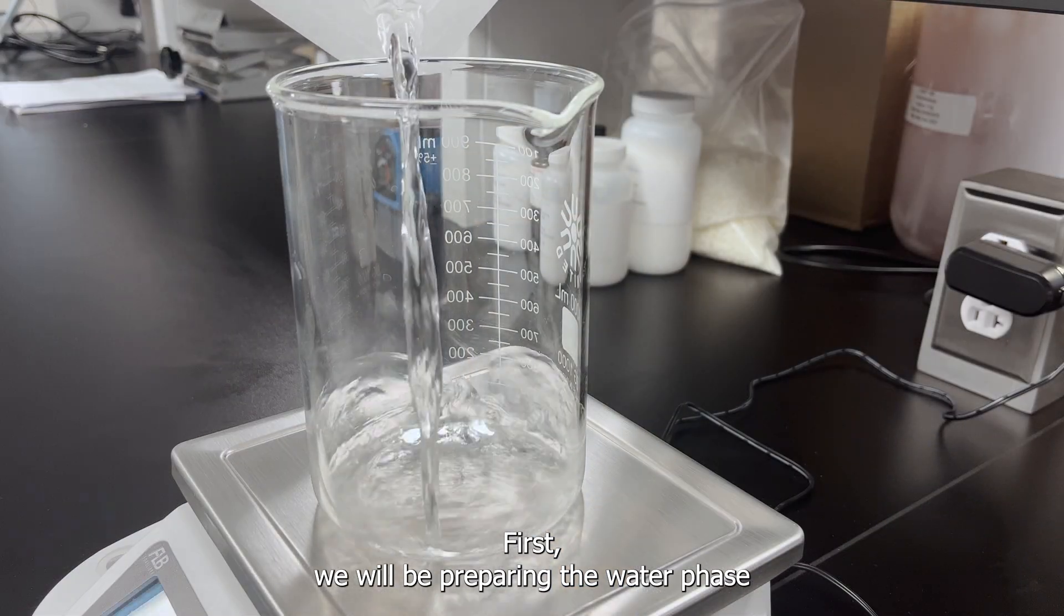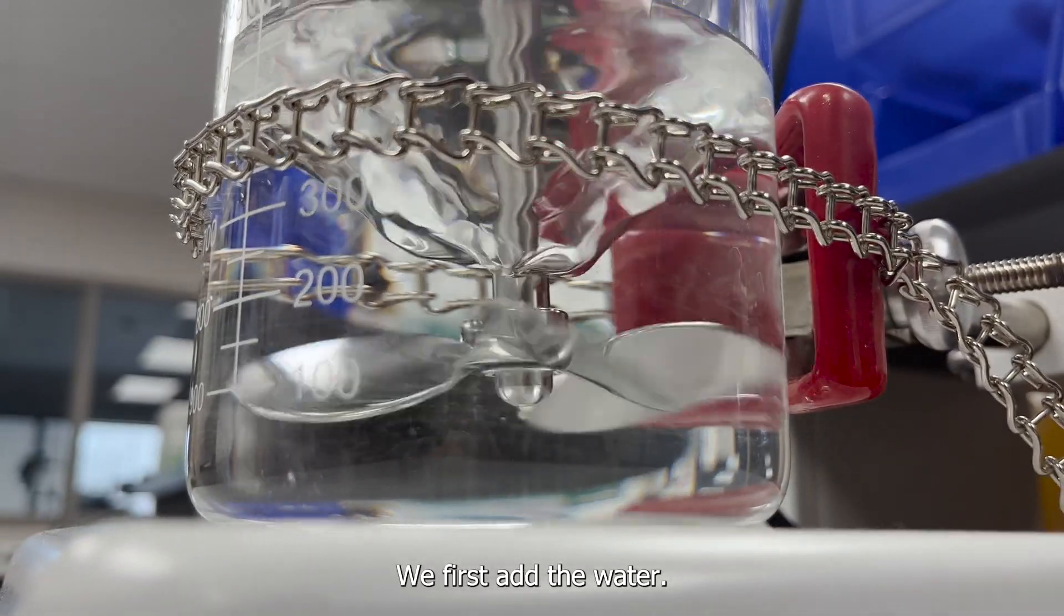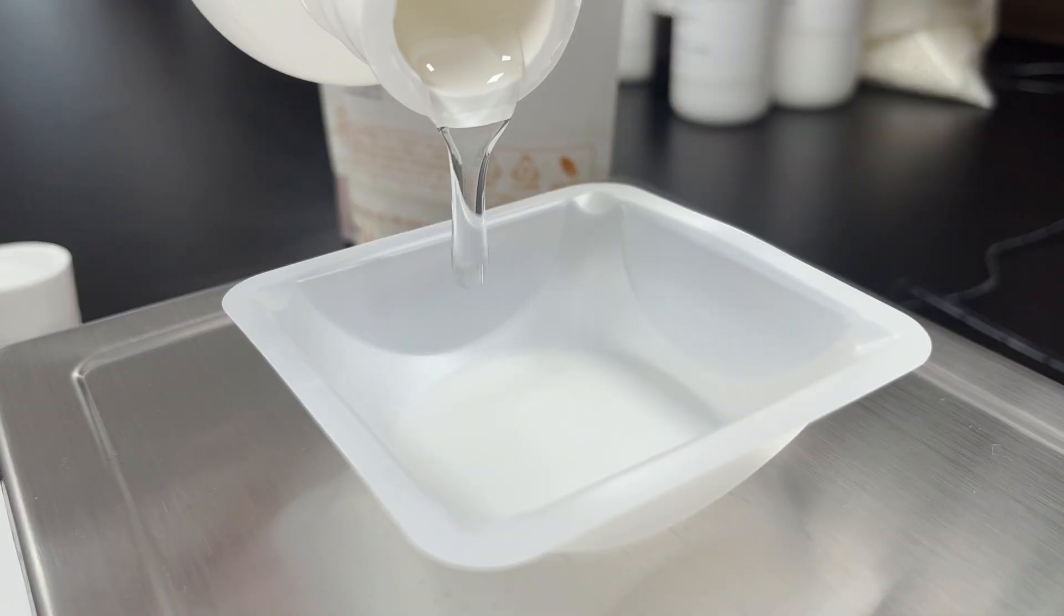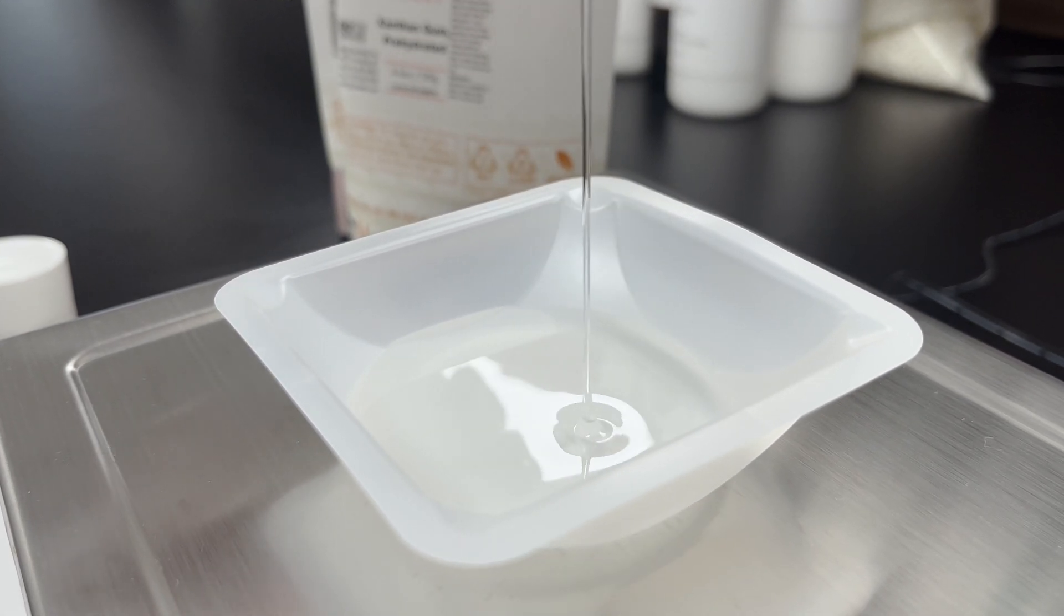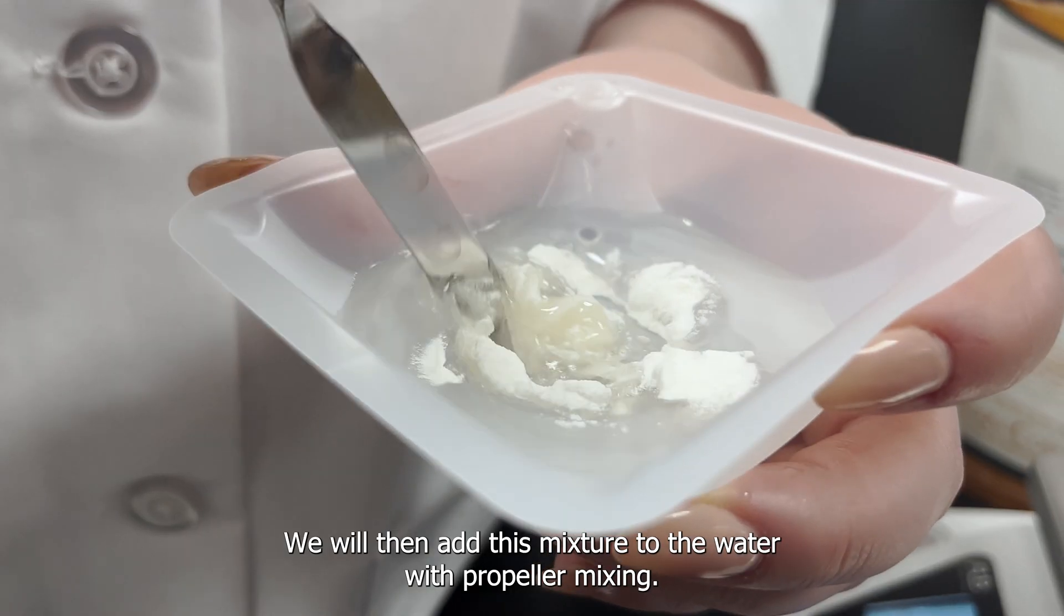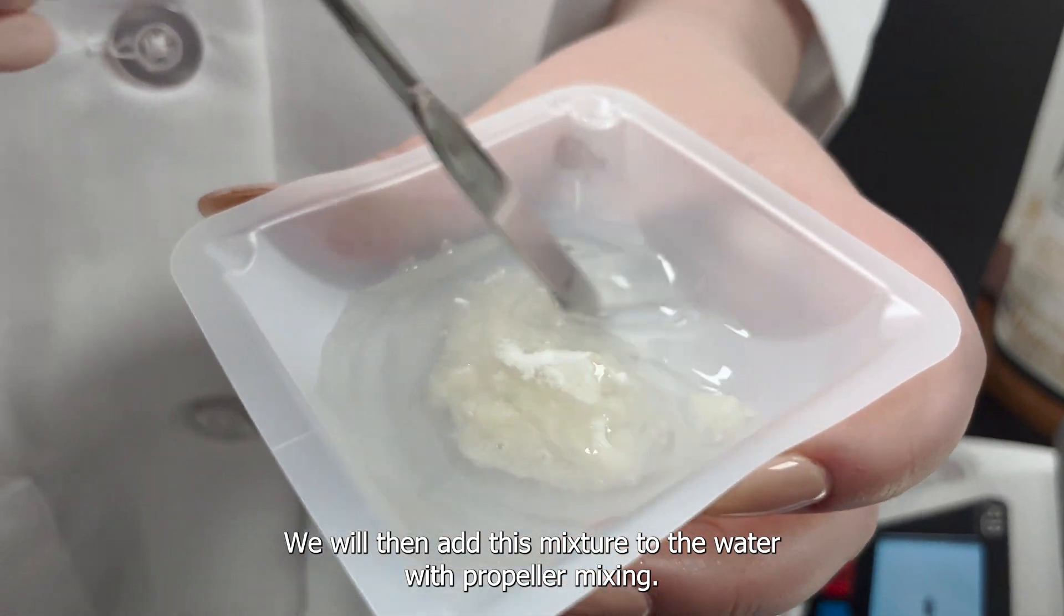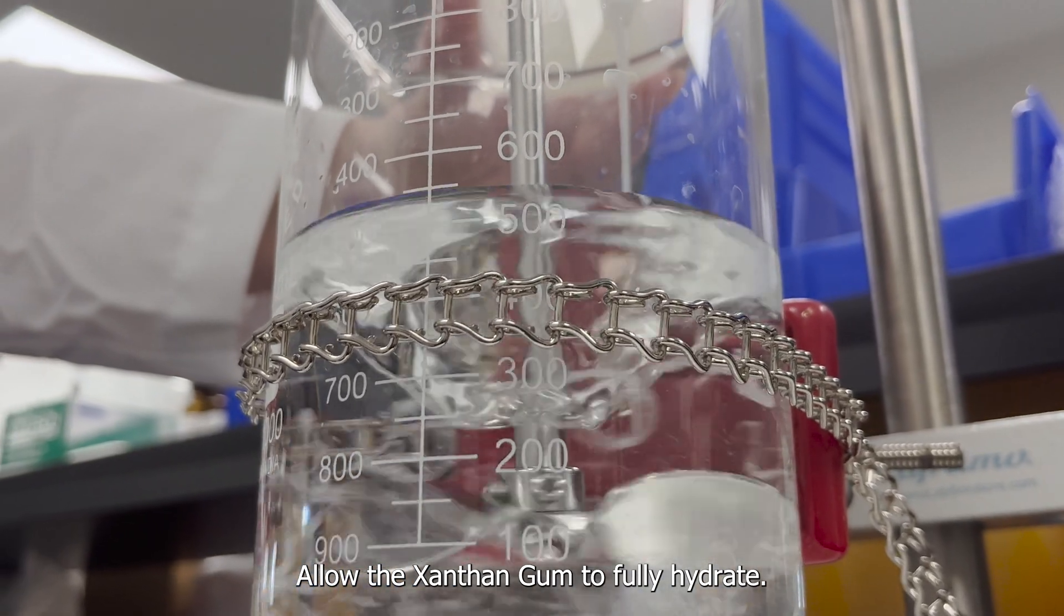First we will be preparing the water phase. To the main vessel we first add the water. Next premix the glycerin with the xanthan gum. This is to aid in its dispersion. We will then add this mixture to the water with propeller mixing. Allow the xanthan gum to fully hydrate.